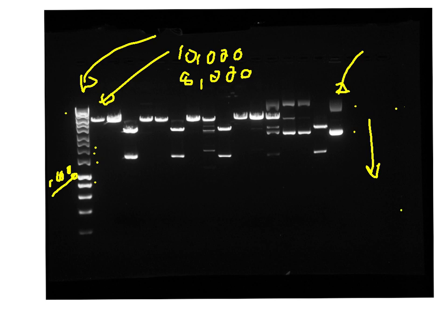This consequently electrophoreses through the gel very quickly, so we go from high molecular weight to low molecular weight, and you can see it moves quite quickly. But often in plasmid DNA extracted from cells there will be multiple forms, so it won't all be supercoiled, you'll get different forms of plasmid DNA including supercoiled and they include open circular.